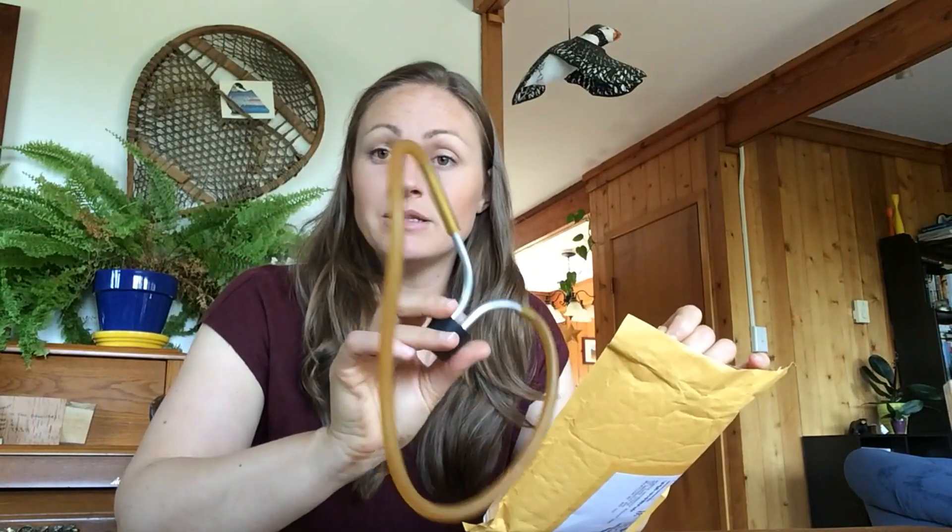That can just be slipped in there. You can keep your pootering device and do more pootering, and also keep the project information and contact information. Inside this envelope there'll be a pre-printed shipping label — that can go right on top of the existing shipping label. It will make sure to get to the right department at Memorial University, and it will be prepaid so you won't have to pay anything. Seal it up, pop it in the mail, and I will be receiving the samples.